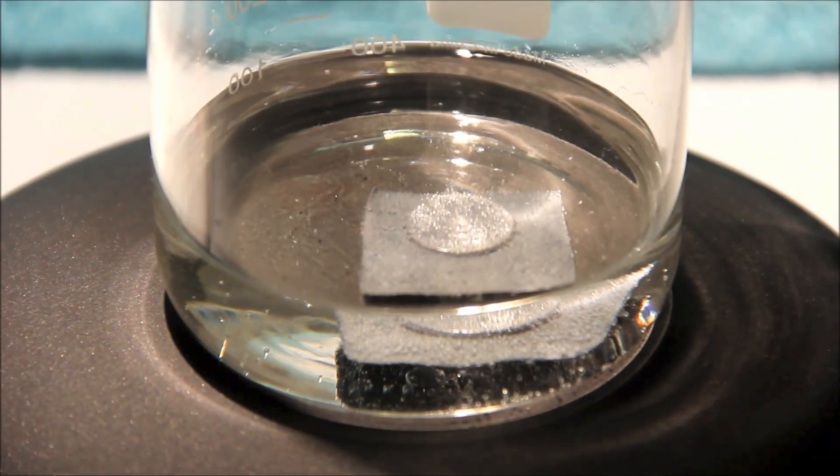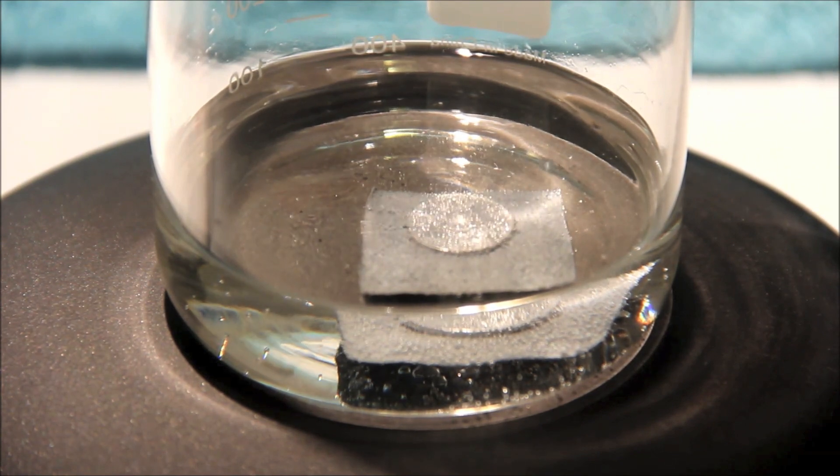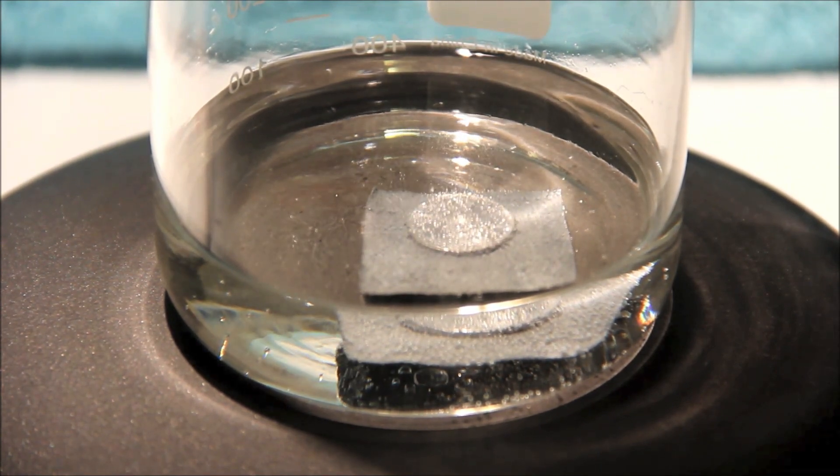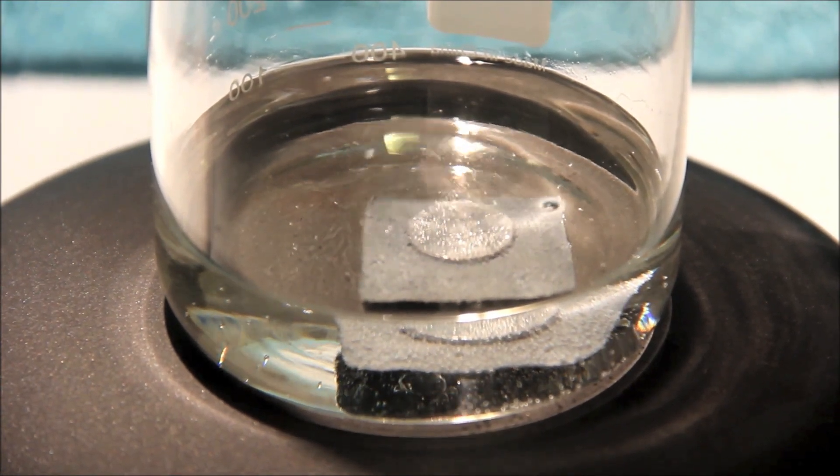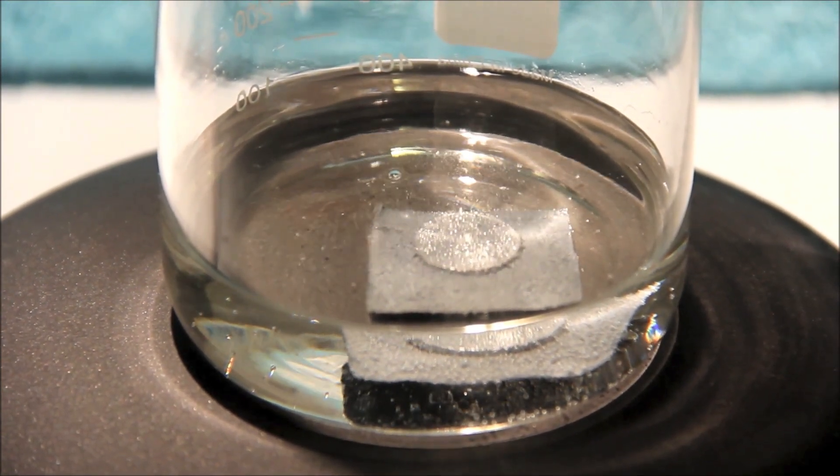Here is the penny after a few minutes of leaving the hot plate on. You can see that it's changed to the silver color of zinc metal. That is because it has been plated in zinc. I also flipped the penny over to ensure both sides of the penny were completely plated in zinc metal.